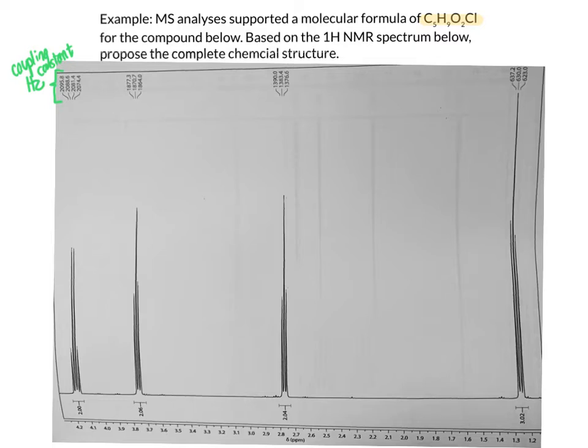Now, be aware that at the top of spectra, you will commonly see 2 types of information. One is that you may see the integrals listed up at the top, that indicate how many hydrogens represent a particular signal. You may also see at the top the chemical shift value indicated, or you can see these coupling constants in hertz. And you'll have to deduce which of those you are looking at. In the case of coupling constants, you will notice that these values are in the thousands, much larger than the integral values of these signals, much larger than the chemical shift values are. So we can deduce that this information at the top has to represent our hertz values of these different signals that we are seeing along the x-axis.